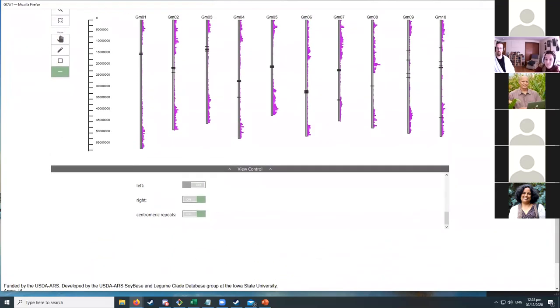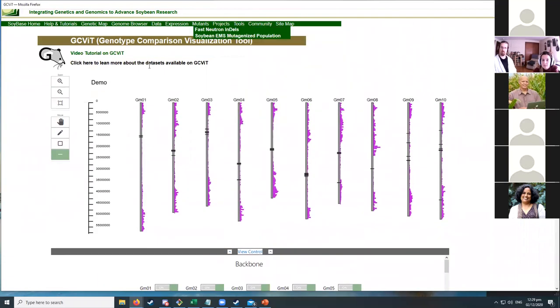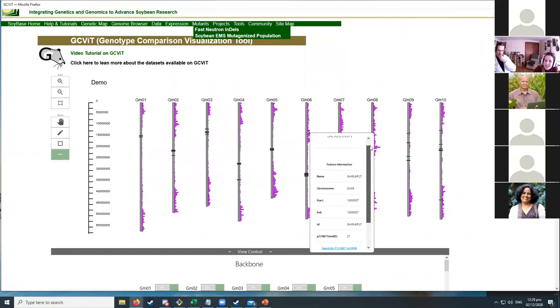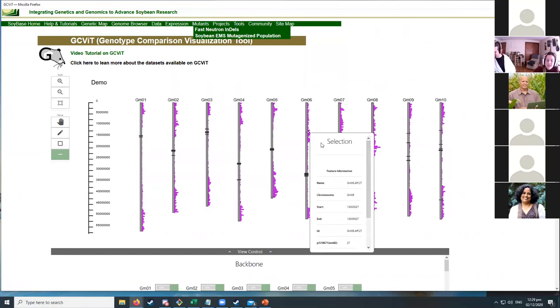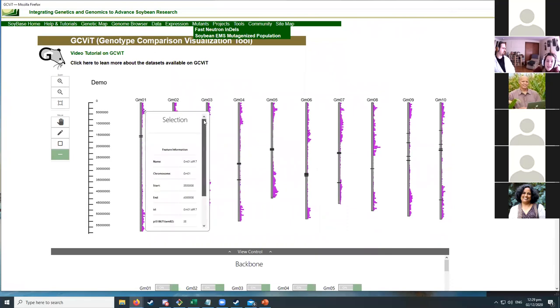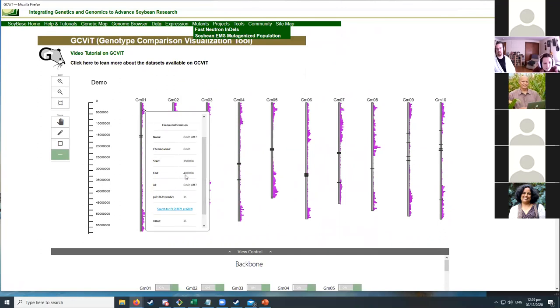Centromeric repeats can be turned on or off as desired. Images can be downloaded as SVG or PNG files. One unique and very useful feature is the ability to click on a region of interest to learn more about it — for example, viewing bin 7 on chromosome 1, covering roughly base pairs 350,000 to 400,000, and seeing that Williams 82 has 35 differences in that bin.